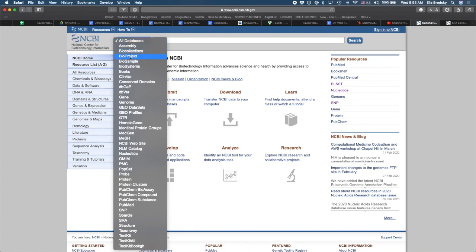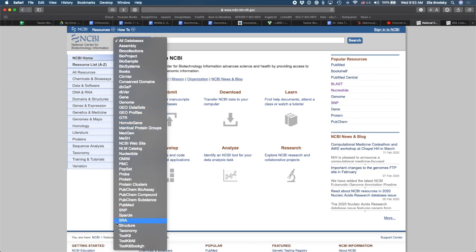It contains a lot of different options for you to find data. Some data is processed. For example, you can find some processed gene expression omnibus data sets in the GEO database. You can also find the raw sequences on SRA.